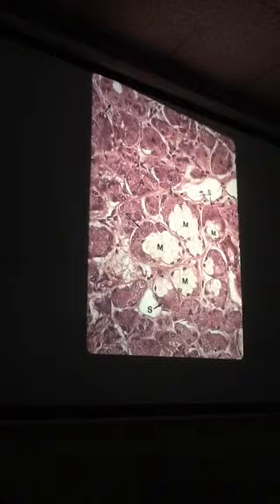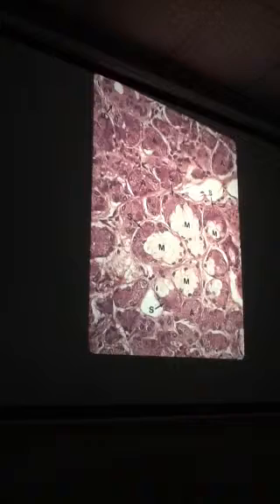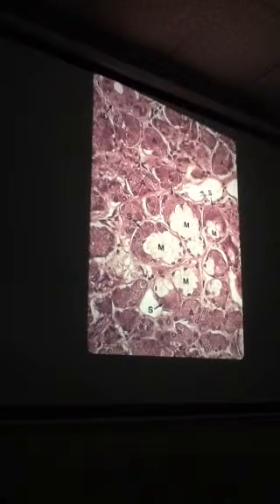You can actually see this is an intercalated right there, going into a striated, which is right here. Larger, thicker wall. If that's an ID, it's strictly asking you, do you know those 3 levels?